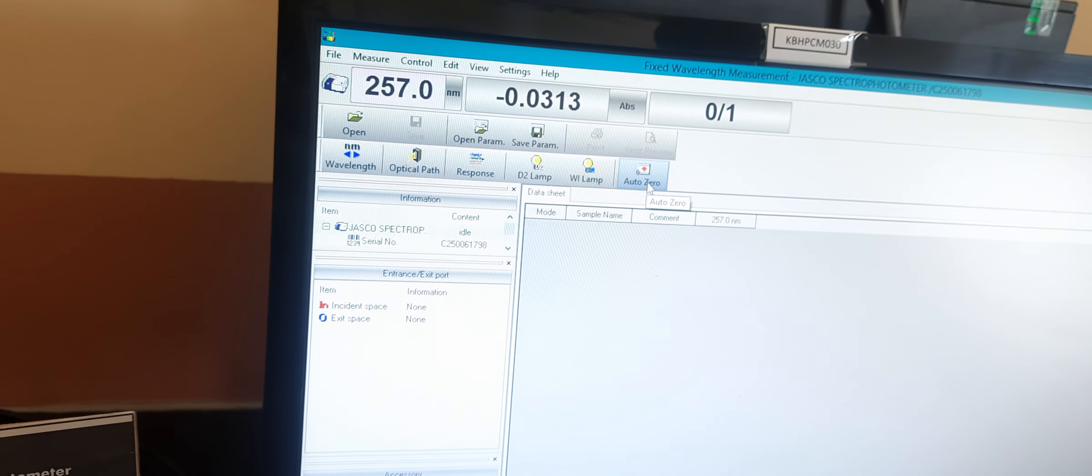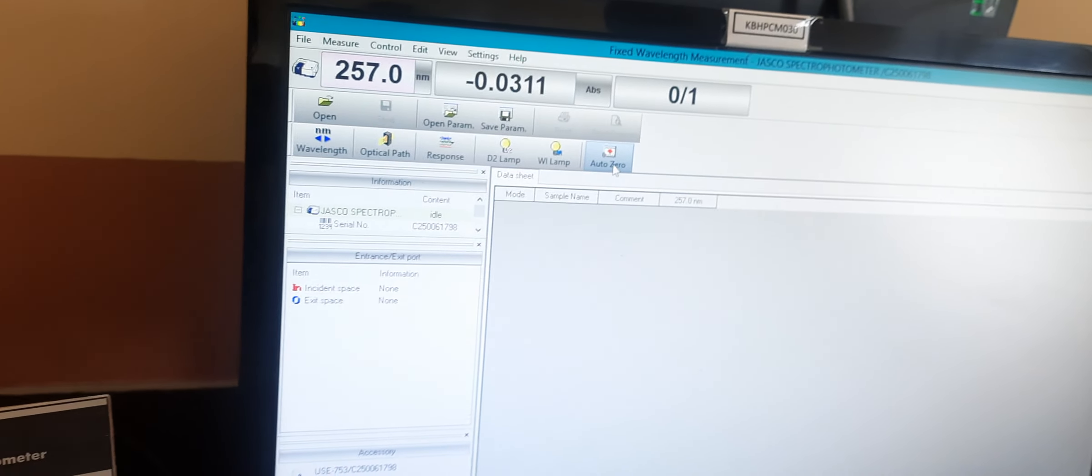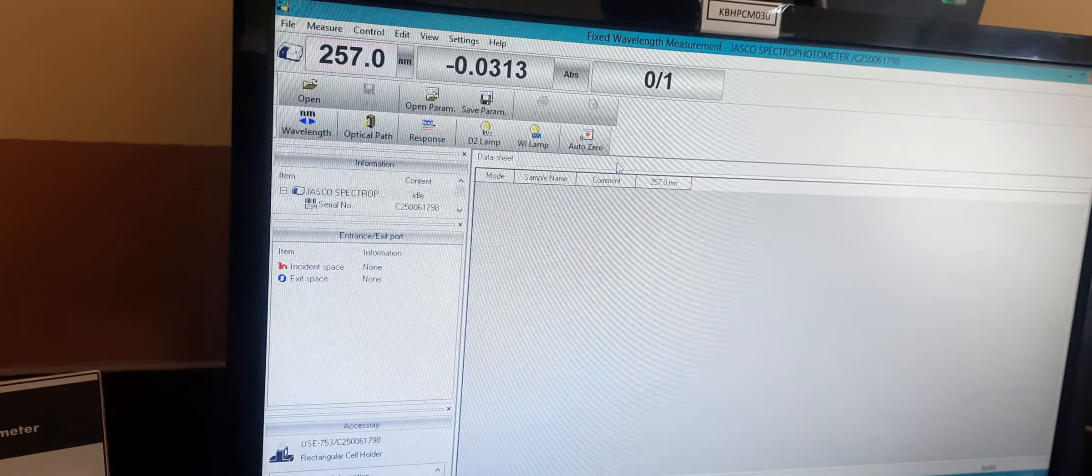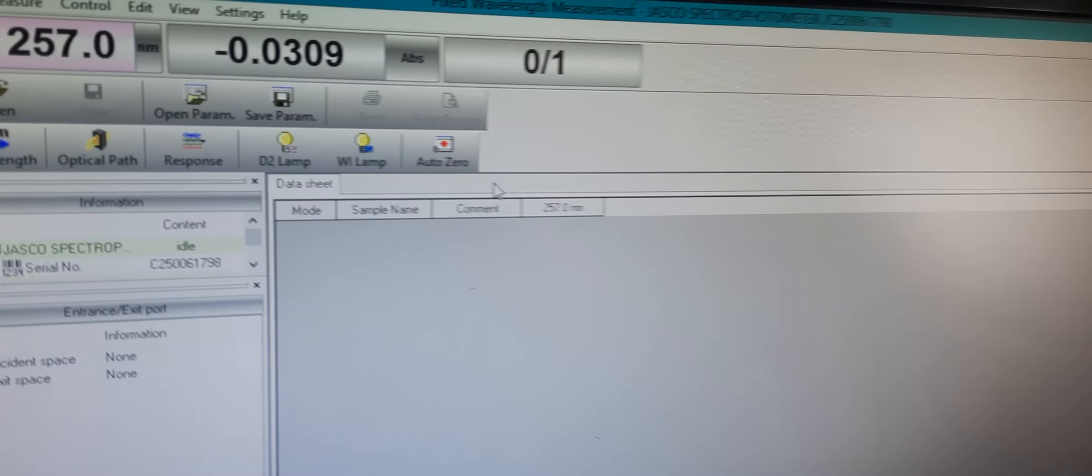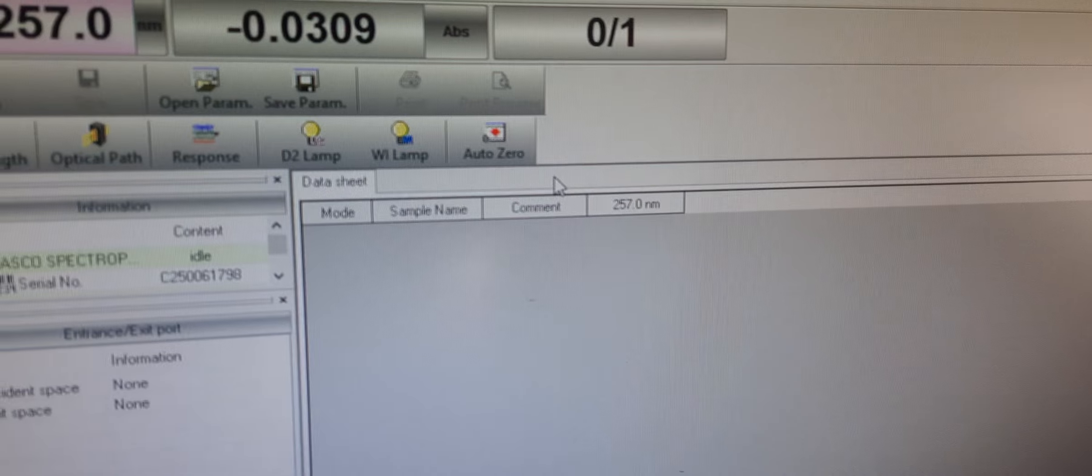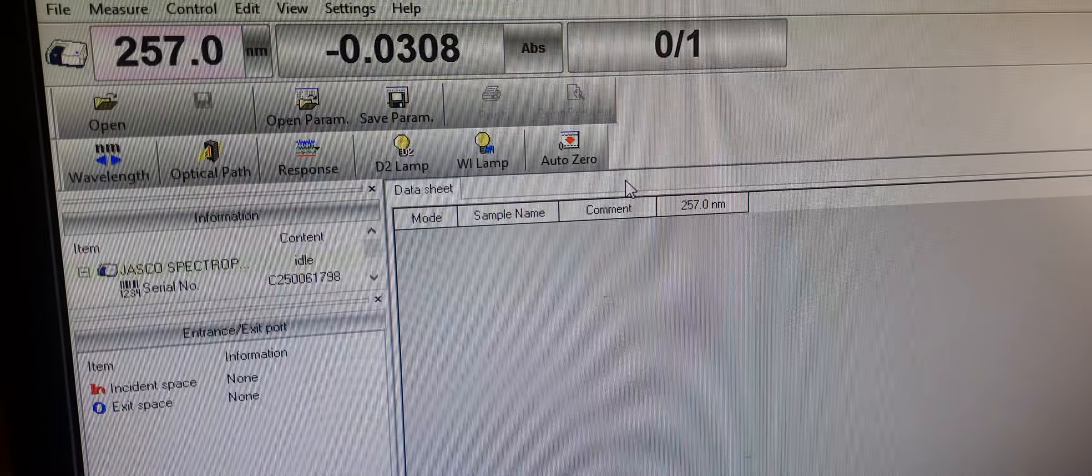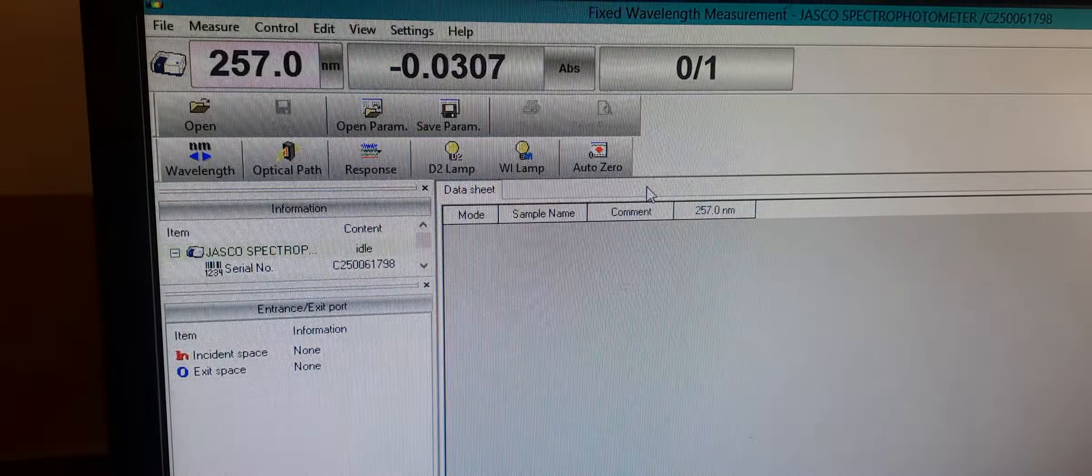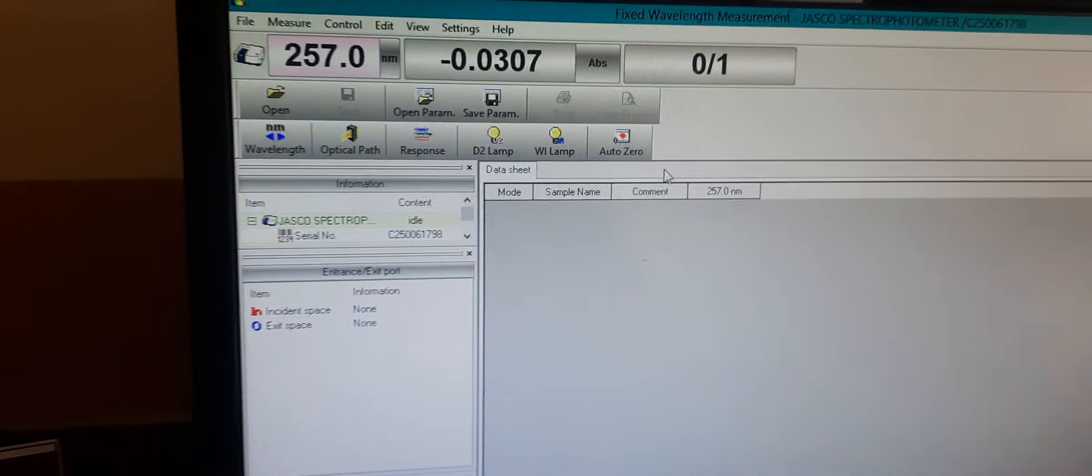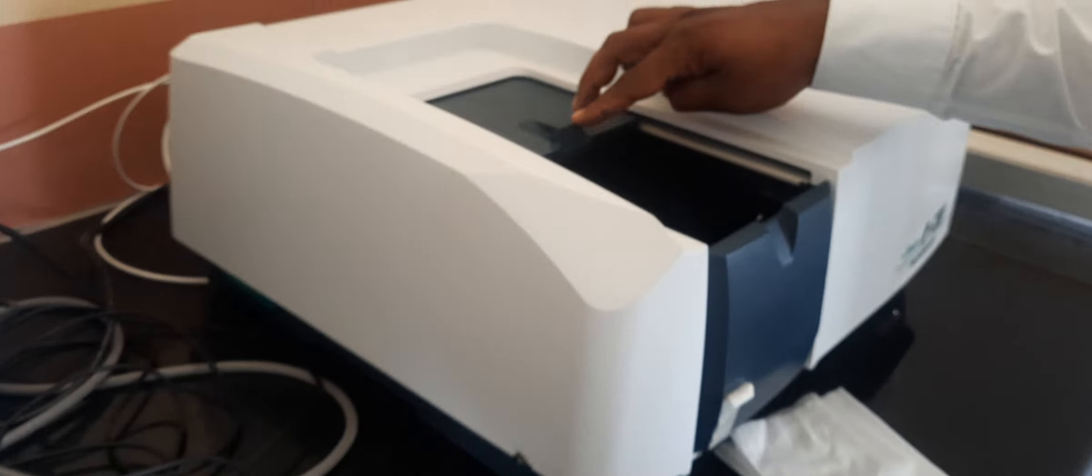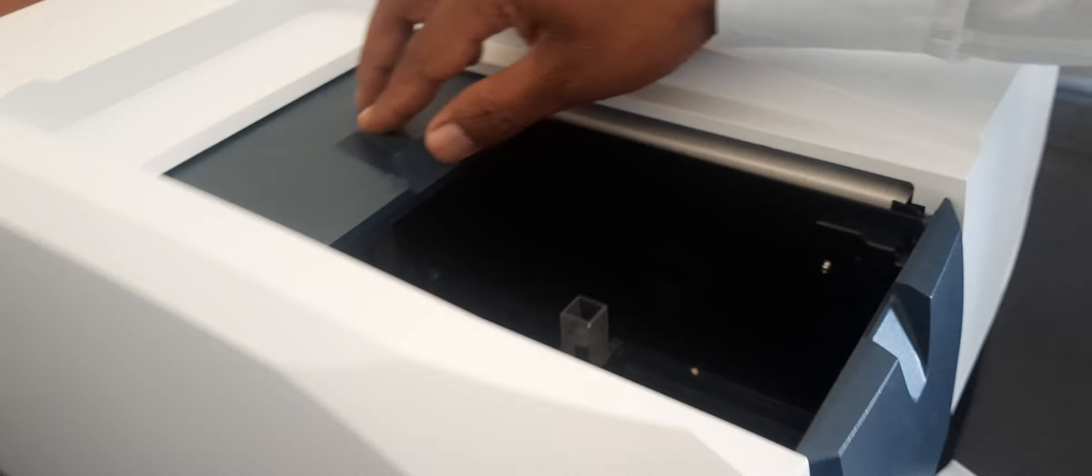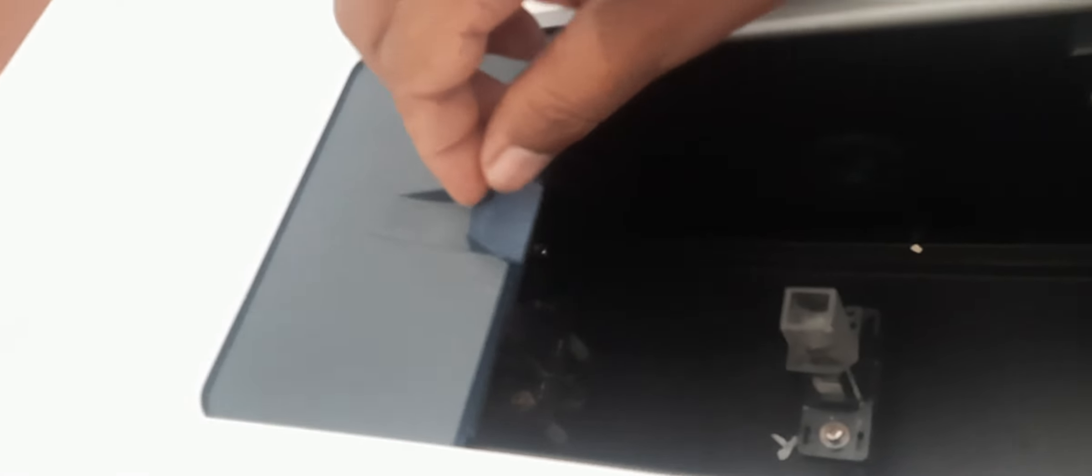Similar to spectra measurement, where we put the solvent we're using for dilution in both cuvettes—that is, reference and sample—in fixed wavelength measurement we are also putting the solvent in both cuvettes.